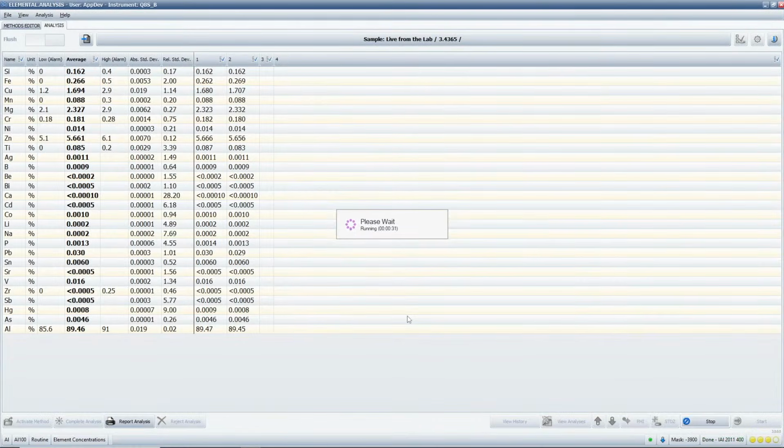So when we say low, how low are we talking about? So we're talking about single digit ppms, and even some cases sub ppm levels. Exactly. Yeah. That's where it enters the high purity instrument.